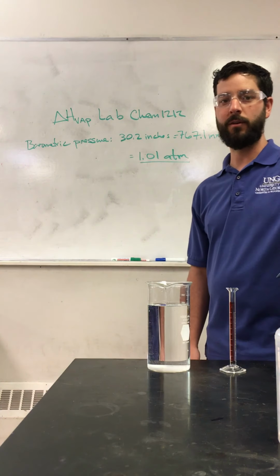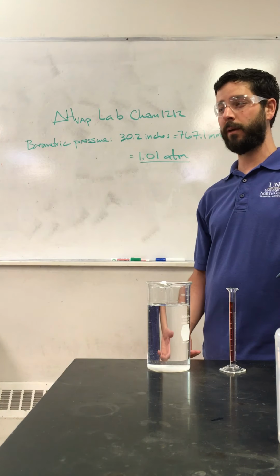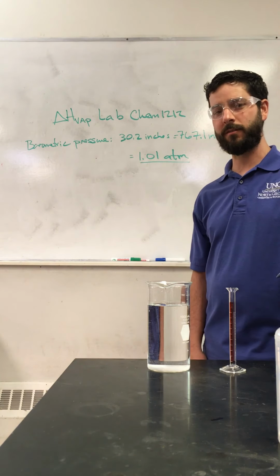Enthalpy of vaporization, sometimes also called heat of vaporization, looks at how much energy is required to vaporize water from the liquid state to the gas state. And we're going to make some measurements of volumes at different temperatures in order to do that today.